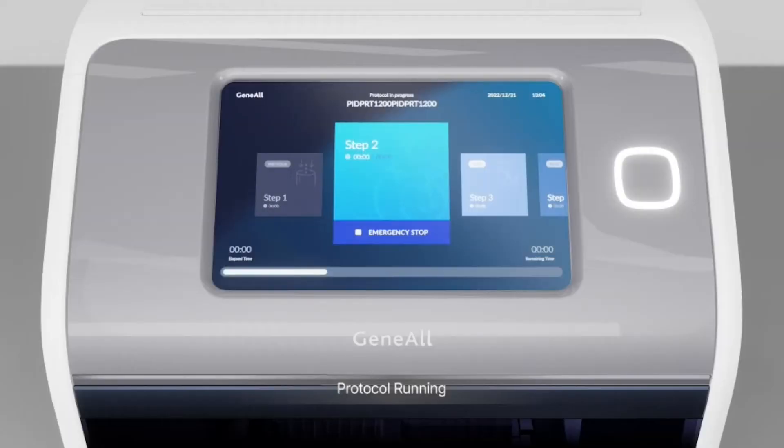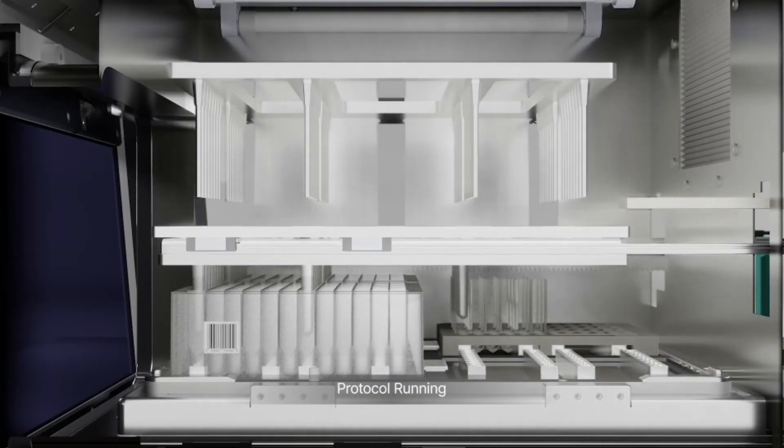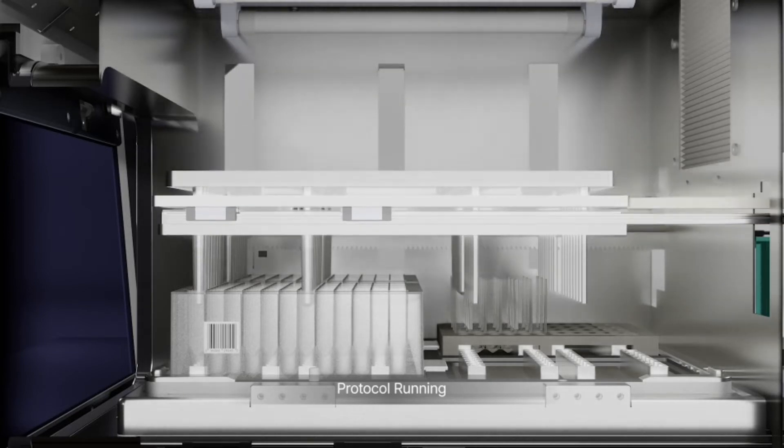The AllEx64 features new movement by heating units. It does not follow the traditional module movement by magnetic rods, but rather movement is controlled by heating units in two rows.